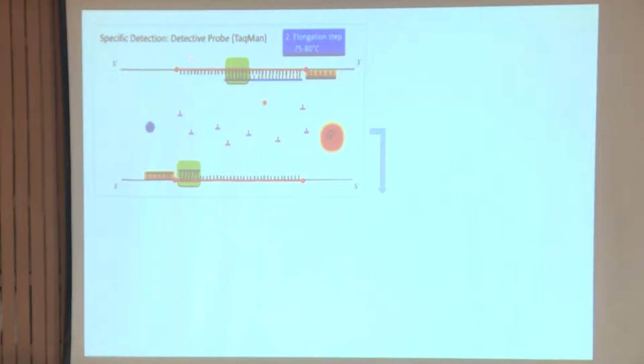Now, the enzyme, right? It removed. Just imagine, this was previously an intact probe, right? After binding, it got disintegrated. So there is a quencher separate and reporter, or fluorophore, separate and other nucleotides, right? Every cycle, this is repeated, right?